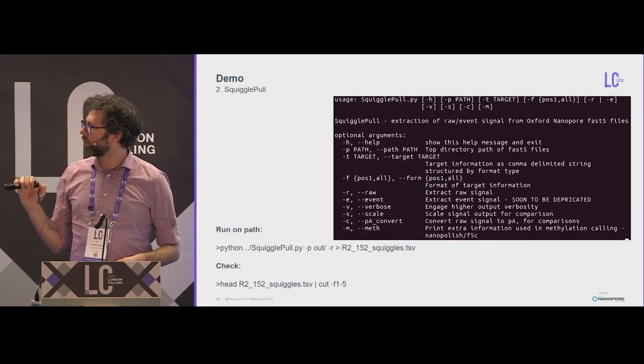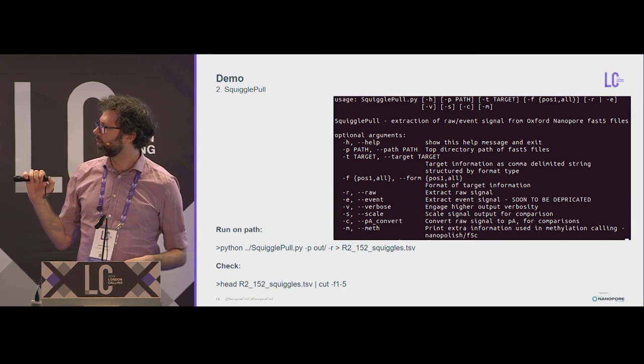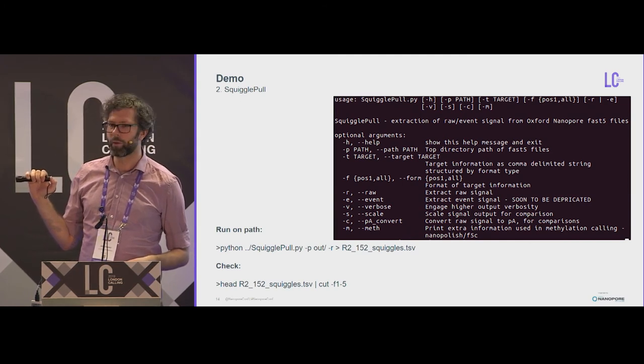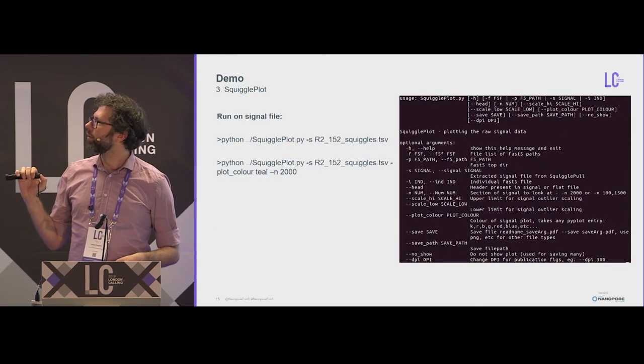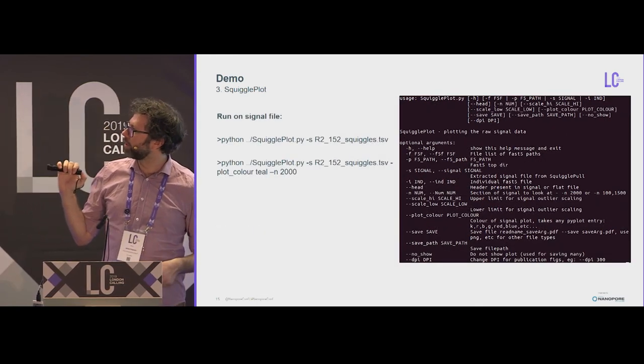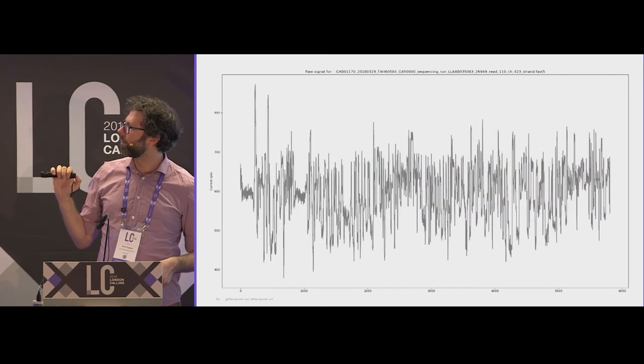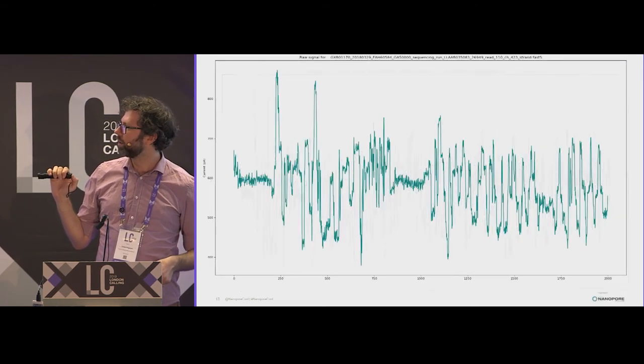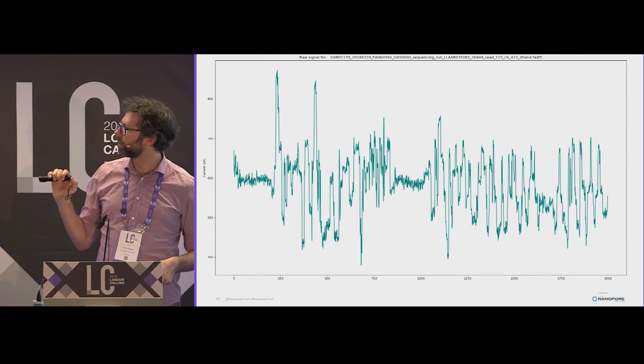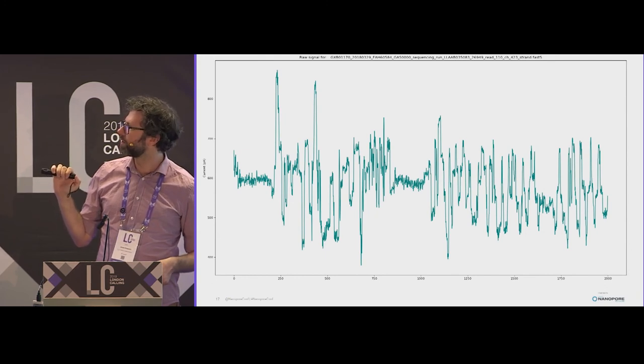We've got SquigglePull. It's very simple. Just Python, what it is, where you want it. Name the file. It makes it for you. We've got SquigglePlot. You can tell it just to plot, say, the first 2,000, and change the color. So this is default. This is zoomed in at 2,000. And when you start looking at squiggles, you can see these aberrations.